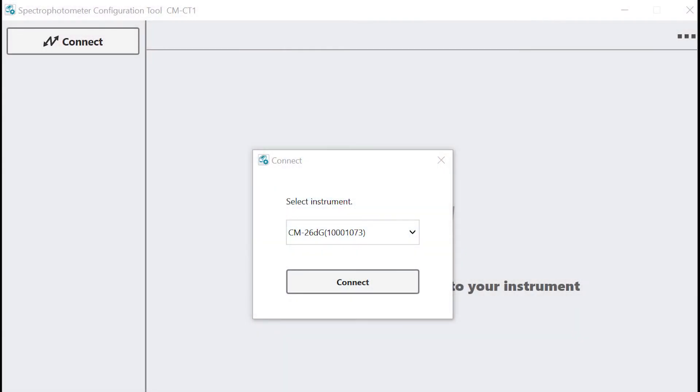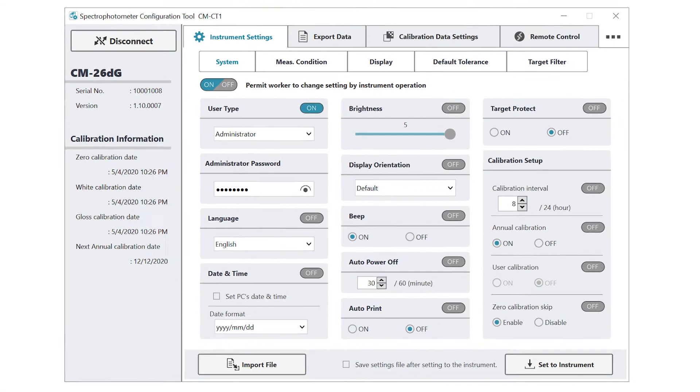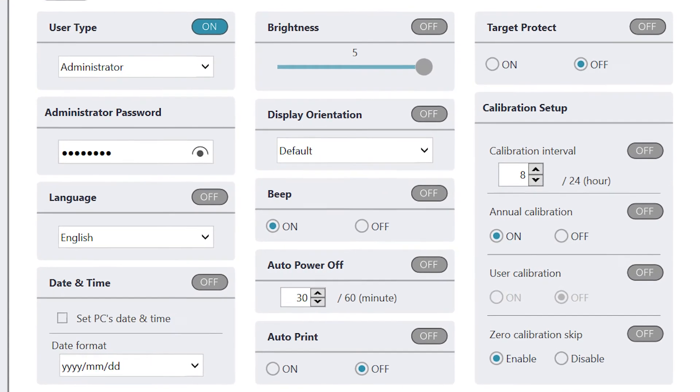While the user interface on the CM26DG is easy to navigate, the CMCT1 tool that comes with the instrument makes things even easier. After you load the tool onto your PC, you can change and save all settings from one screen.